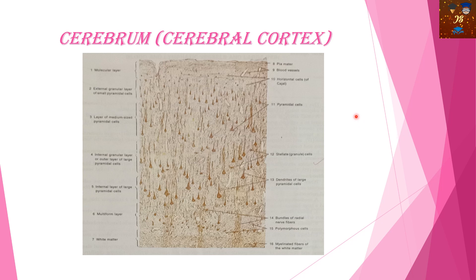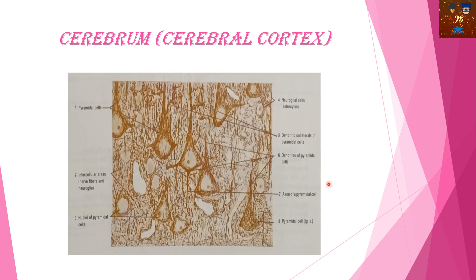Now, for the cerebrum or cerebral cortex — you can see dotted cells highlighted here; these are called pyramidal cells. In the cerebellum we have Purkinje cells; in the cerebrum we get pyramidal cells. Pyramidal cells are the main identifying feature for the cerebrum or cerebral cortex. This is how the pyramidal cells actually look — like a pyramid.